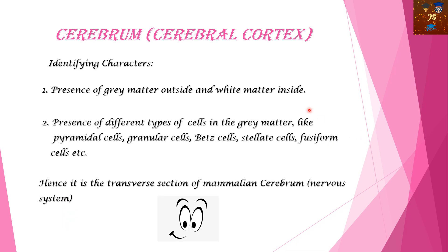Here the identifying characters for cerebrum: presence of gray matter outside and white matter inside, with different types of cells in the gray matter — pyramidal cells as the main cell, then granular cells, small spotted cells, bed cells, stellate cells, and fusiform cells. Hence it is the transverse section of the mammalian cerebrum of the nervous system.